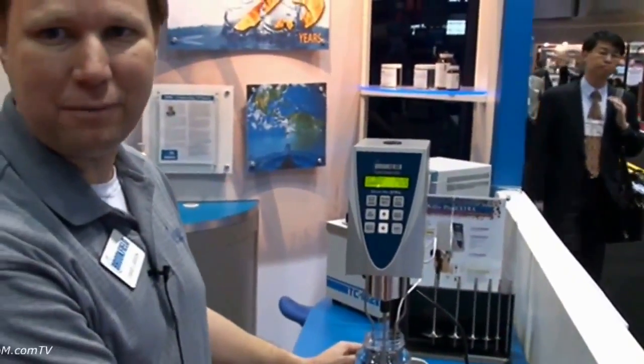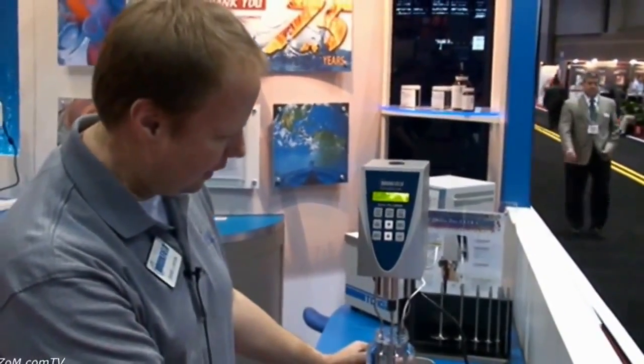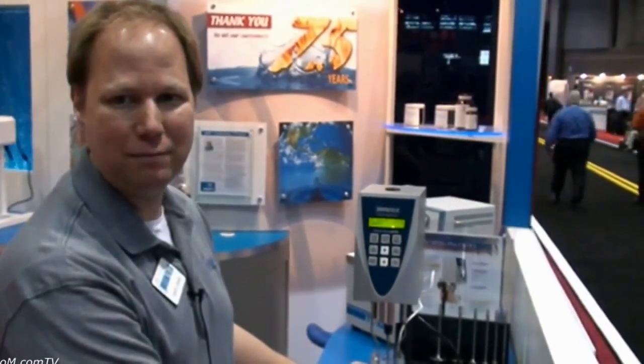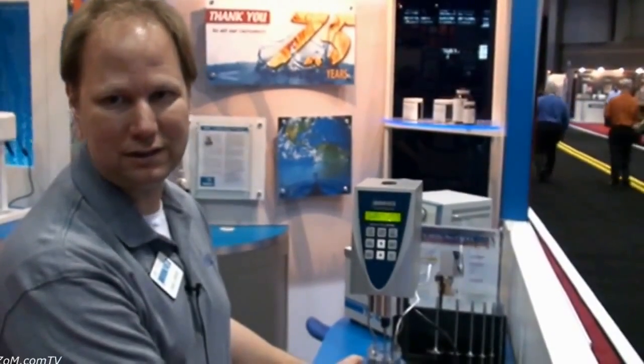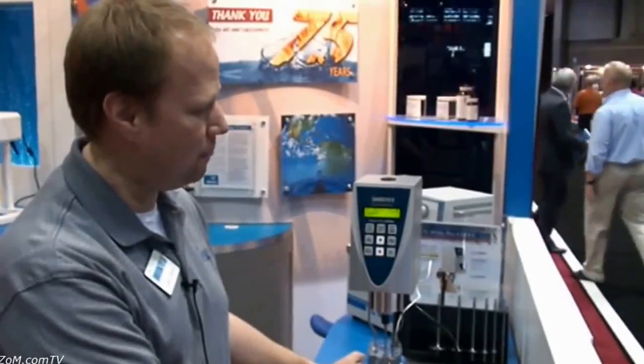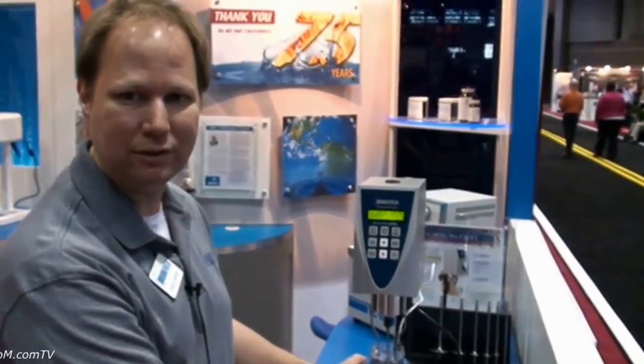Or 75 years, I apologize. It's just a standard of the industry. And is this your latest and greatest model? This is our most popular model — we have many models, but this is the newest version of our most popular model. And when did you release this one? This year, 2009.